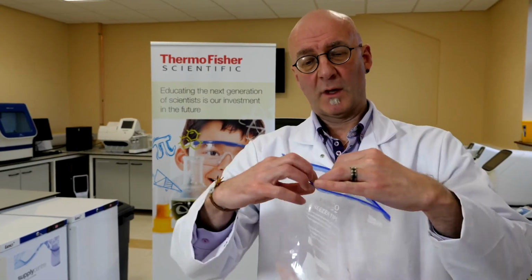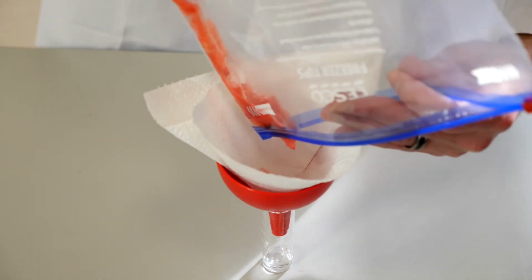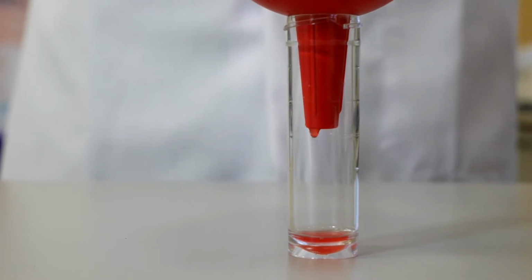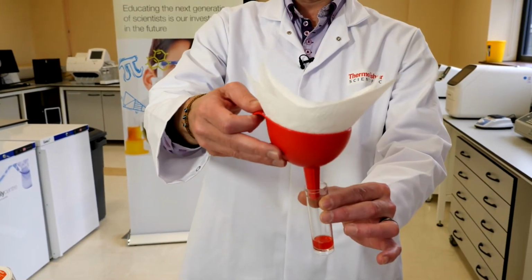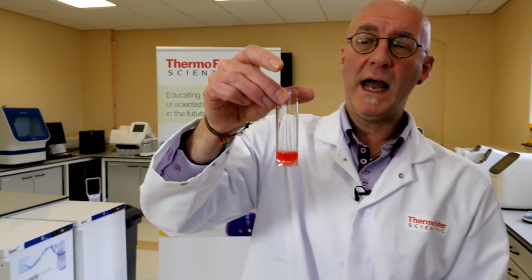Take the bag, open the bag. We're now going to pour the contents of the bag into the tube. And what we're going to do now is allow that to flow through gravity, and once we get our solution, we'll then move on to the final piece. We now have our tube with our strawberry debris in there. We don't need this now. This is going to be discarded. I'm just going to put this over here. We now have our tube.